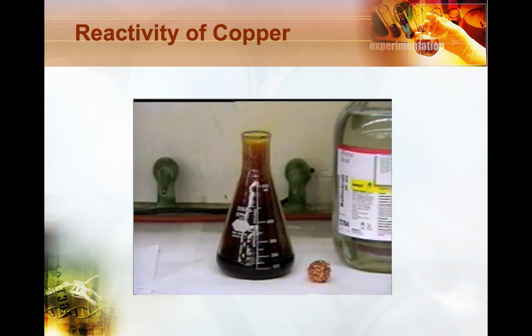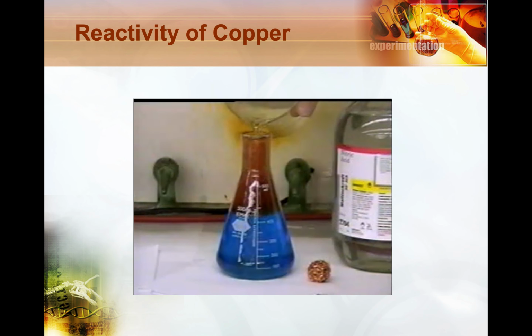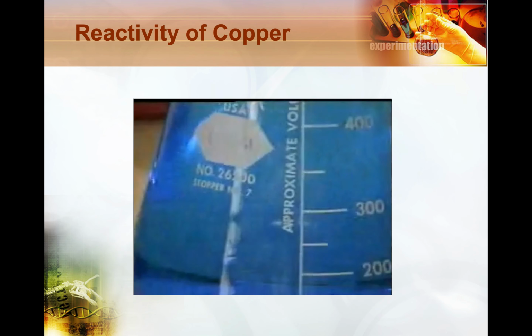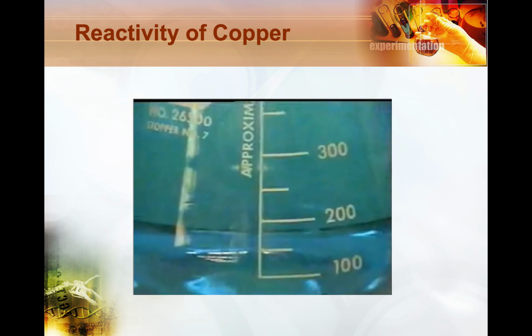There's less and less gas being evolved. The next step then, adding the sodium hydroxide. Oh, sorry, this is just adding the water. You add the water and you can see that, again, significant change from where you started. So write down all your observations.